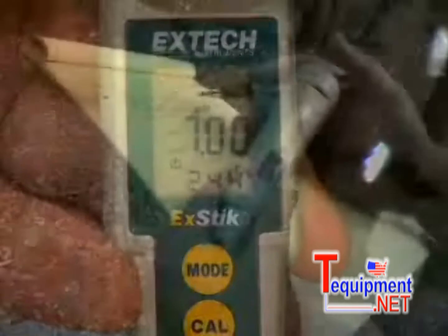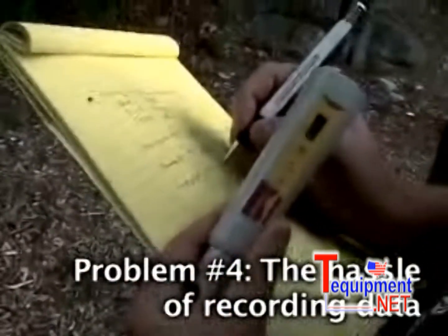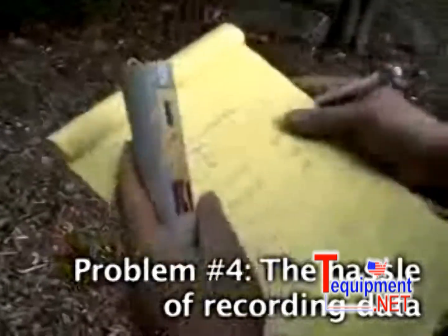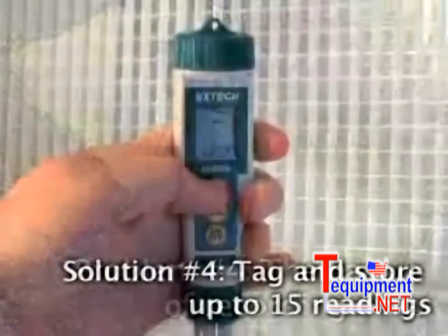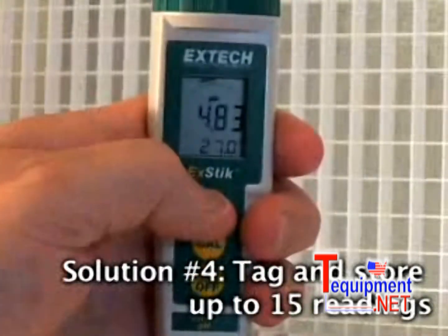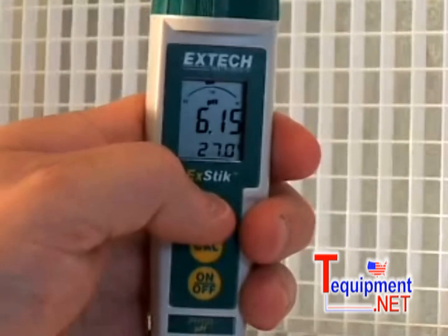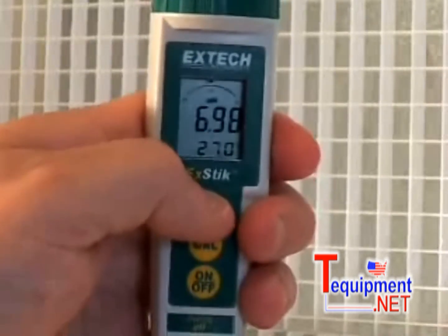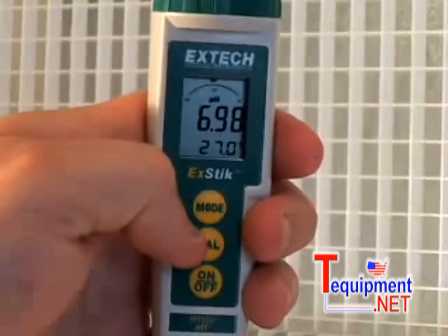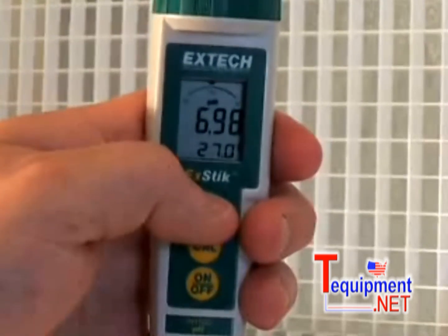Problem number four: recording data on paper can sometimes be difficult when you are taking measurements out in the field, especially during times of unpredictable weather conditions. The built-in memory featured on the EXTIC pH meter will record up to 15 measurements. Each stored reading will be labeled by a number for easy recall, eliminating the need to bring samples back to the lab. It not only saves time, but provides maximum accuracy for on-the-spot data recording.